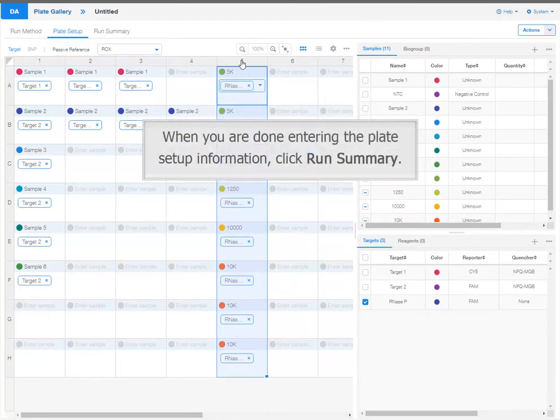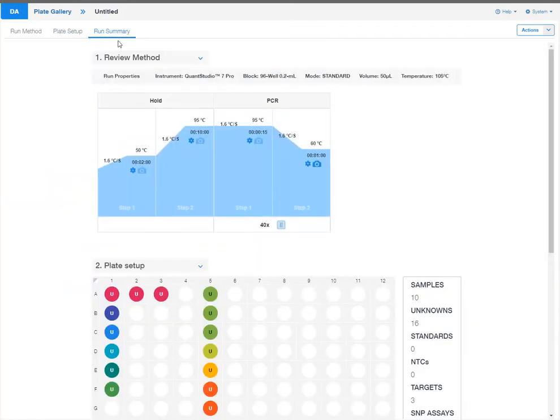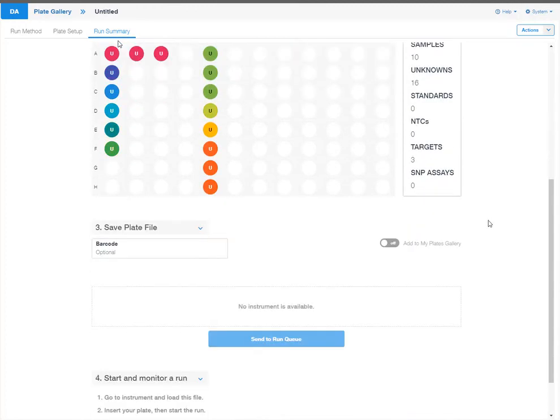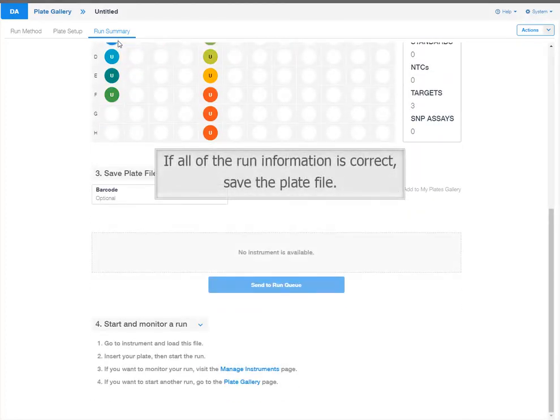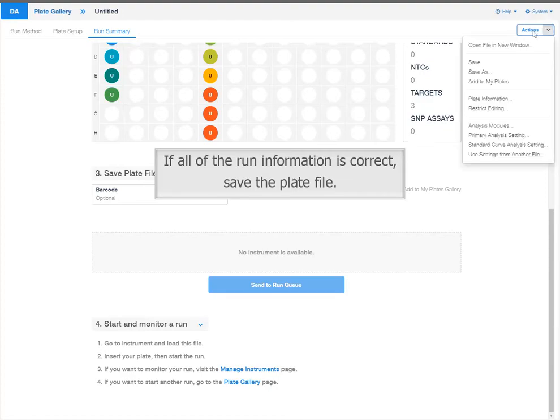When you are done entering the plate setup information, click Run Summary. In the Run Summary tab, review the run method and the plate setup information. If all of the run information is correct, save the plate file.